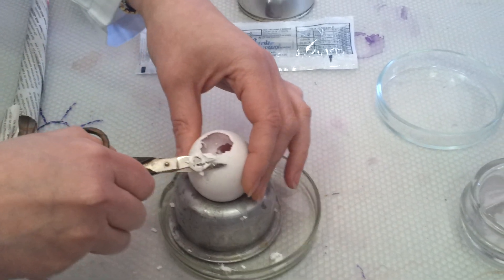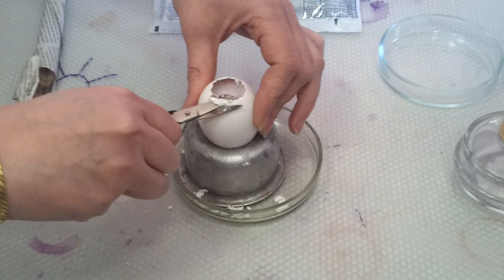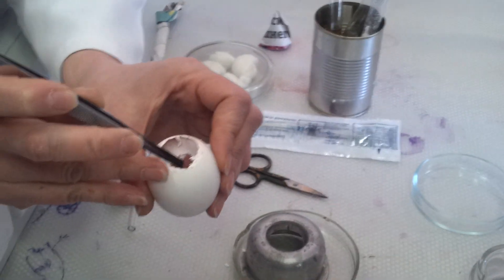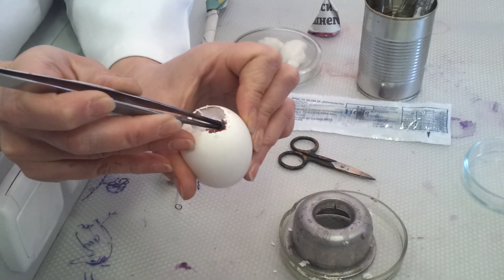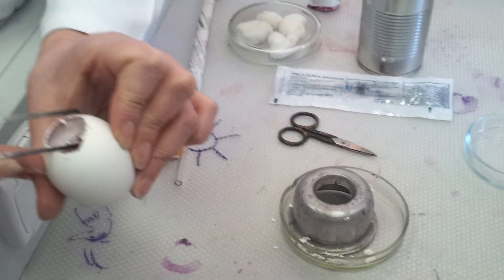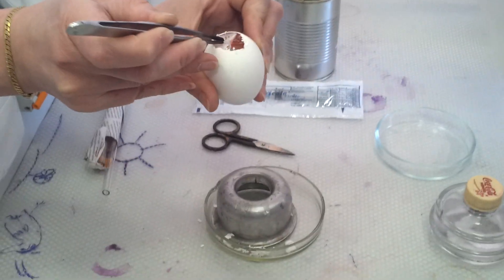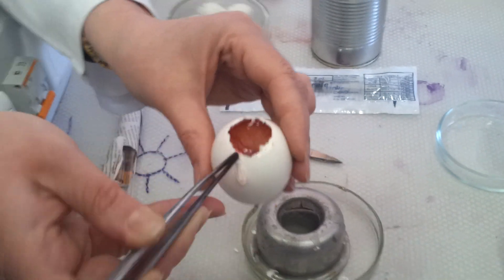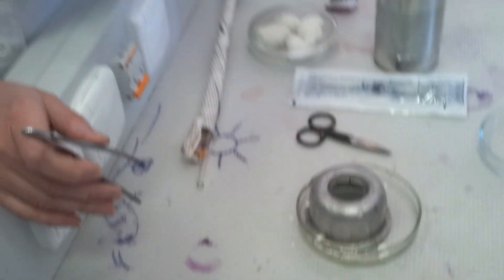I'll open it now widely, as it is never done in reality, to show you all the components inside. You see this membrane? And inside you may see the blood vessels, and the yolk sac, and this fluid — this is allantoic fluid.